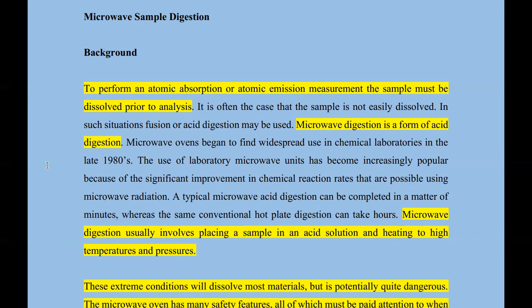So wet ashing is likened unto microwave sample digestion, because with microwave sample digestion, we're talking about more or less decomposing the rocks. We're talking about exposing these rock samples to high temperature, but in the presence of an acid. That's why it is called wet ashing.